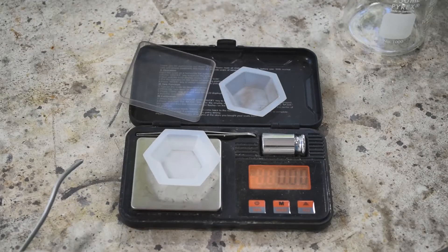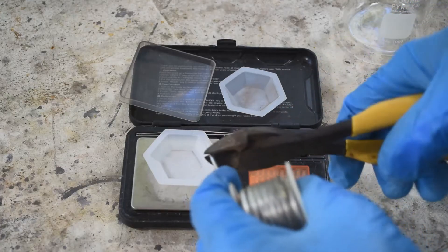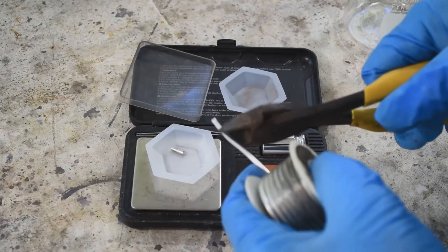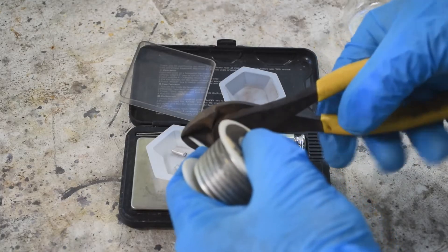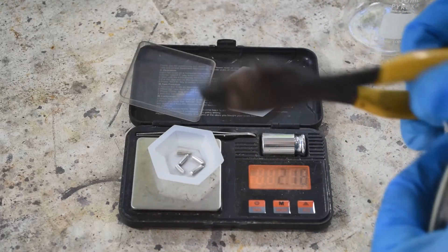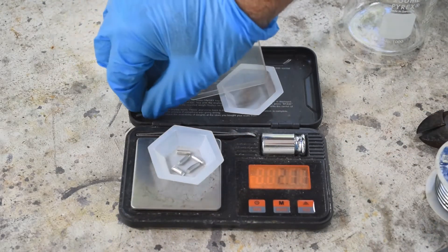The amount of solder you use really isn't super critical, but somebody always wants to know exactly how much. I cut my solder into about quarter-inch lengths — about six millimeters for those in the metric world. Again, not super critical. We're going to go with somewhere between two and two and a half grams; we'll aim for two and a quarter. A little over or under isn't going to be a problem.